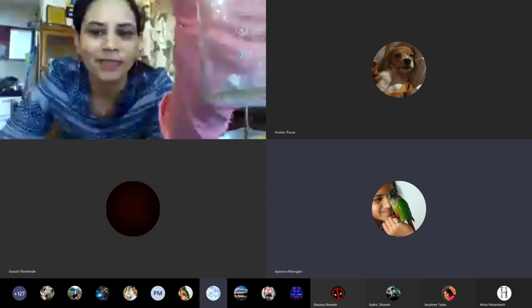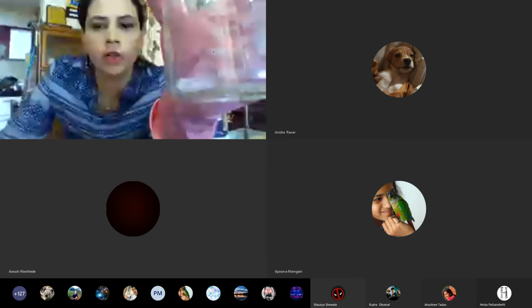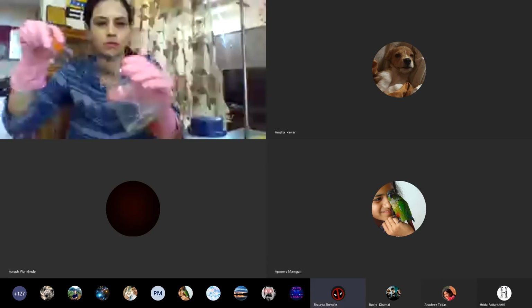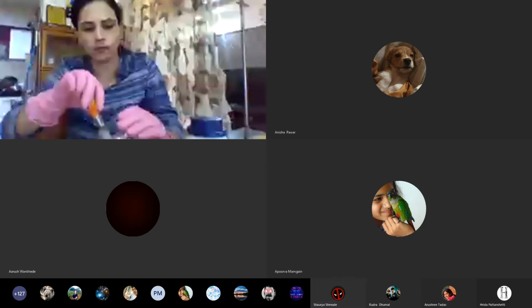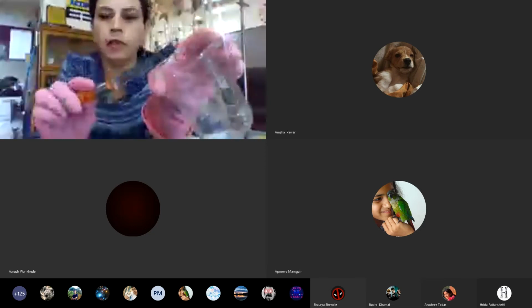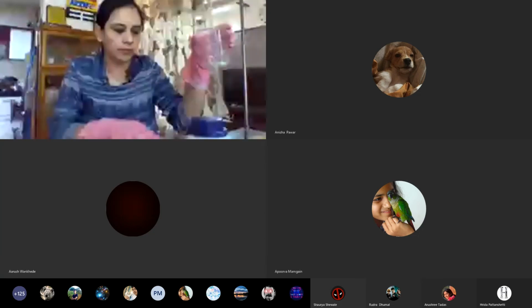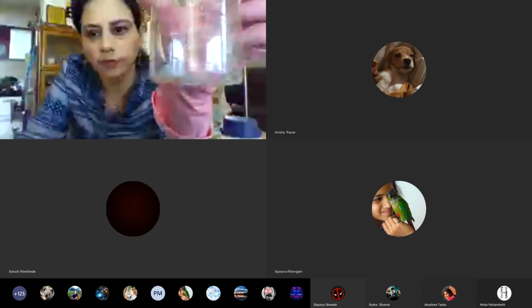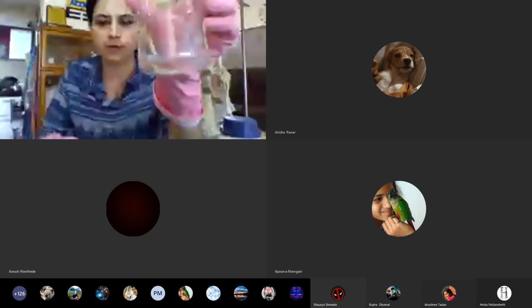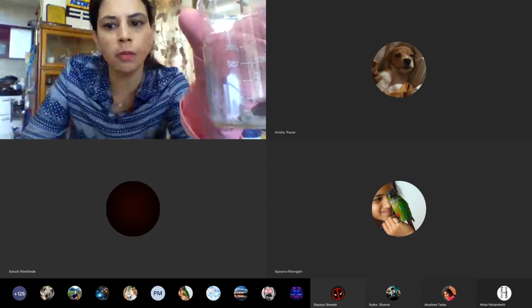No, ma'am. Could you repeat? Write down: sodium reacts with oxygen, forming sodium oxide. Ma'am, is this the observation? Yes. It is a very soft metal. Okay, note it down. So the next, now let's... Ma'am, can you repeat? Sodium reacts with oxygen, forming sodium oxide.